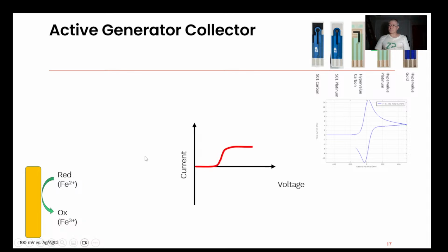Now I've done it here on what's called a line electrode or a microelectrode. When you start getting down towards microelectrodes, you don't necessarily have the classic cyclic voltammogram that you would normally expect, because now you're in a very different diffusion regime. But it doesn't matter whether you get the classic voltammogram or something more like a microelectrode response. You get some current as you do a voltage sweep, and that's the oxidation of ferrocyanide to ferricyanide.